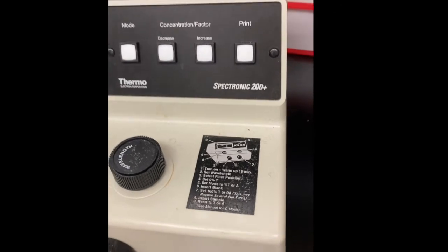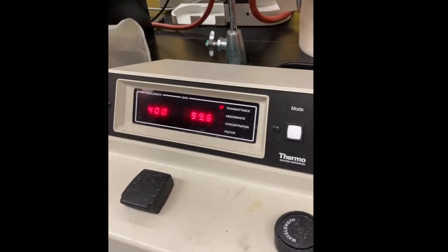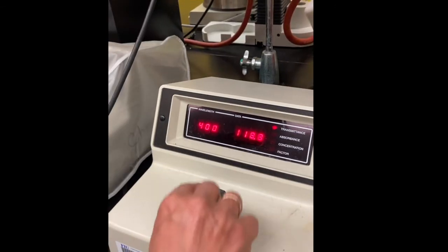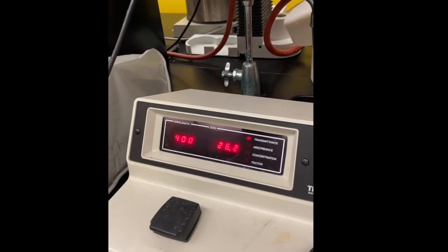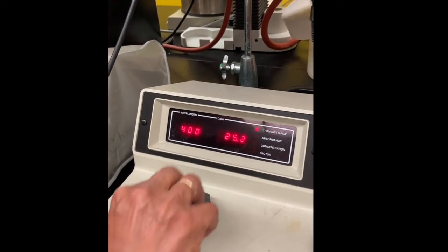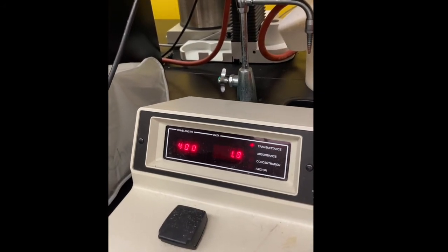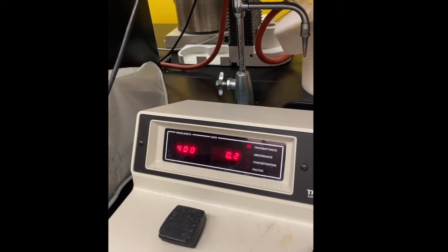First, we need to set transmittance to 0 without a sample. We need to remove anything from here, and we are setting transmittance to 0.